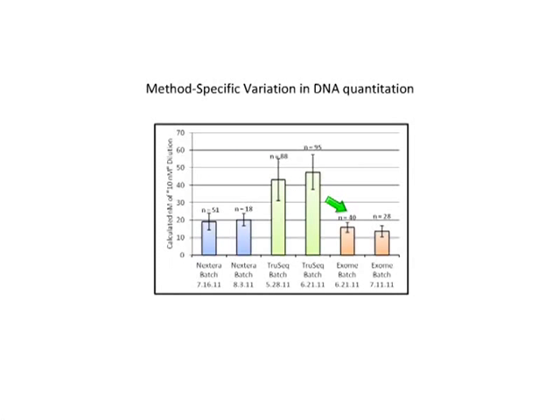And this is, as you can see, with a reasonable N number for each one, 51, 18, 88, and 95, and two different TruSeq RNA batches, and then two different exome batches, that it is fairly consistent with each library type.